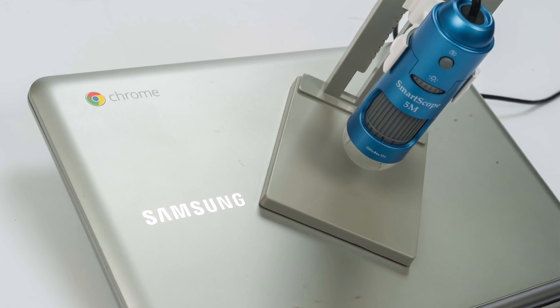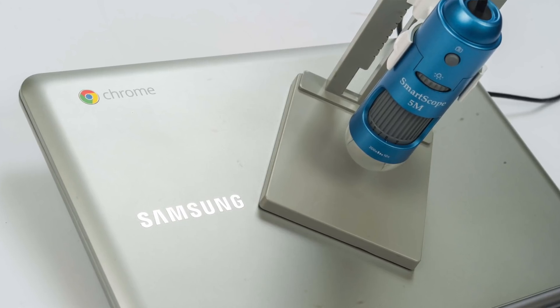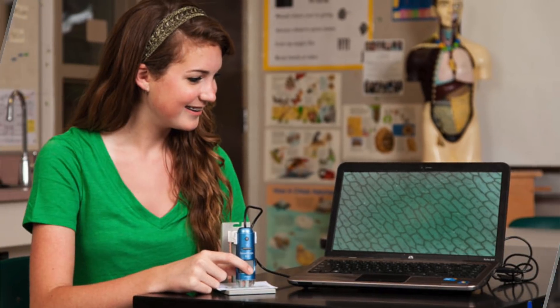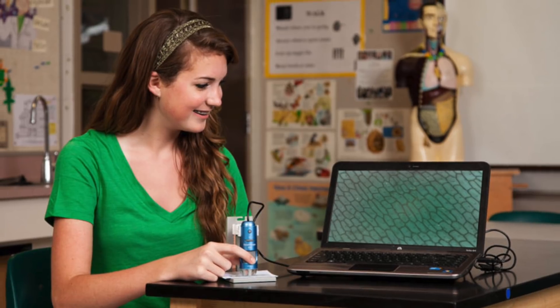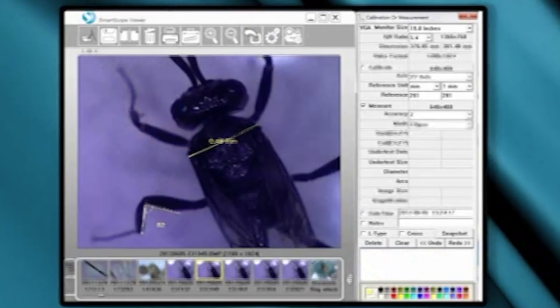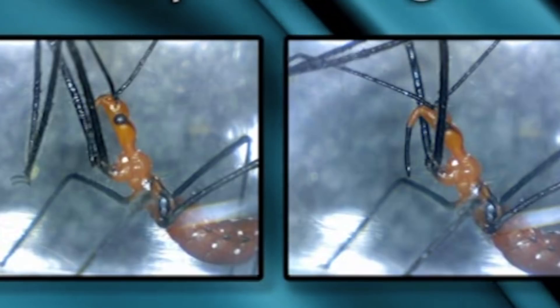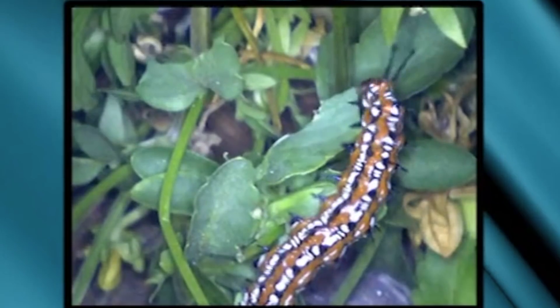It includes the Smart Microscope Online Viewer web app, so no software install is needed, making it perfect for Chromebooks, the most popular computing device in U.S. classrooms. This is an educational tool unlike any other, with advanced features like measurements, side-by-side comparisons, assessments, annotations, and the ability to save directly to Google Drive.